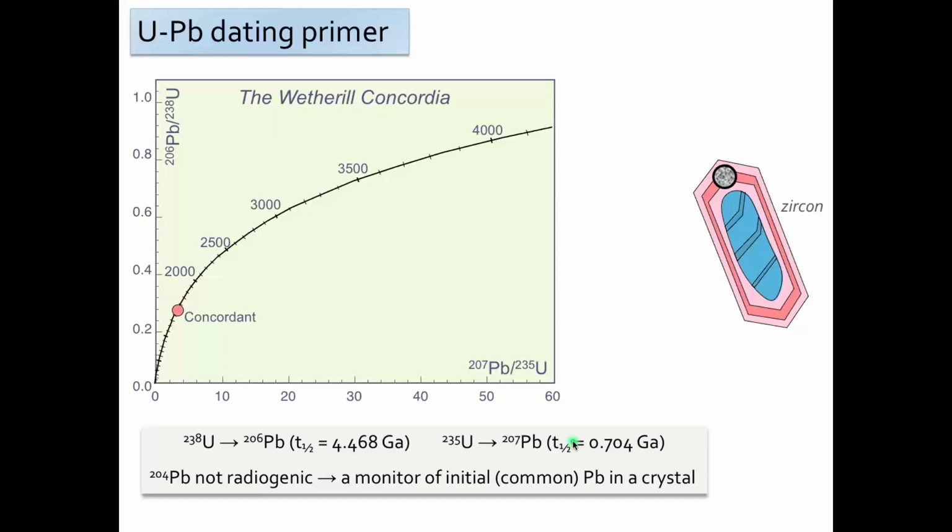Zircon is quite a refractory mineral that's able to survive multiple episodes of sedimentary recycling and also even survive inside a magma chamber for a while. So maybe this zircon, the rim of which grew in a granite, has an older core. And this older core was floating around in the granite magma. And if we place the spot on that, it's much older and it's giving an age of around 3.5 billion years.